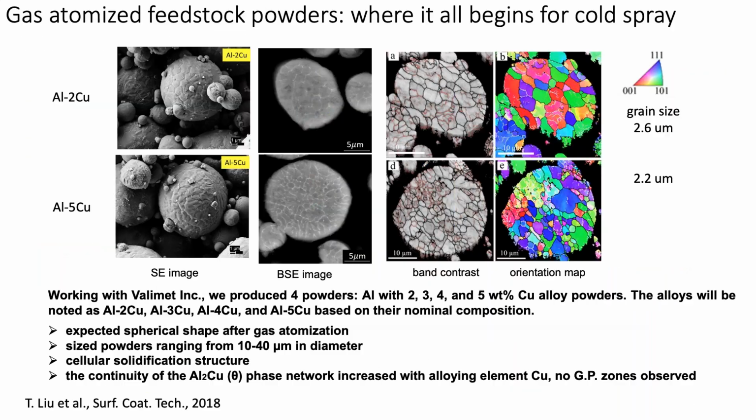That's also true for these particles here. We use a special epoxy when we're doing this, but we basically mix powder into epoxy, cast it into a mold, and then do mechanical metallography. Again, vibratory polishing with, say, colloidal silica is a key final step. But that seems to work fine.